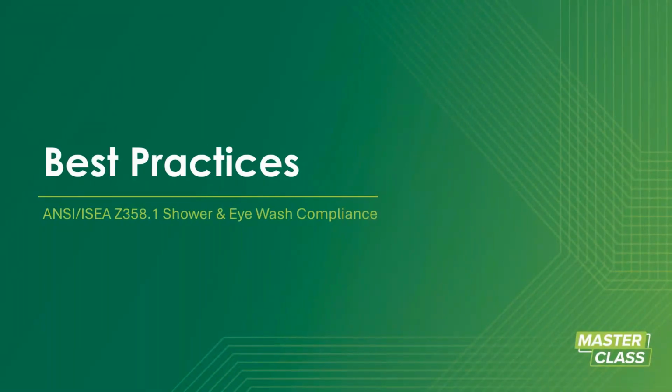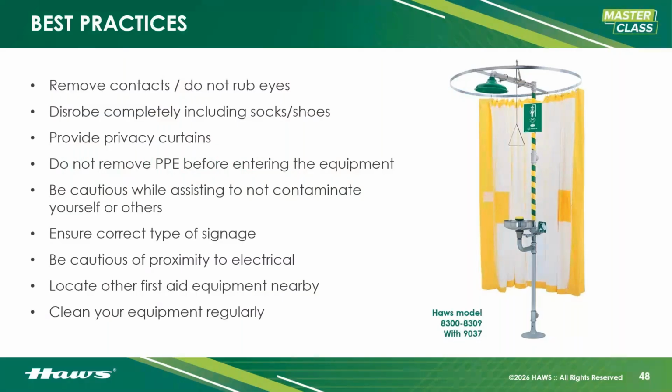And we are going to go over some best practices. We've been doing this for a very long time, and over the years we compiled all that knowledge, as I just mentioned, and put together some best practices for victim comfort. So make sure that you remove your contacts and do not rub your eyes. Any chemicals that get in or any dust particles will go under the contacts, so it's really important that you take those off.